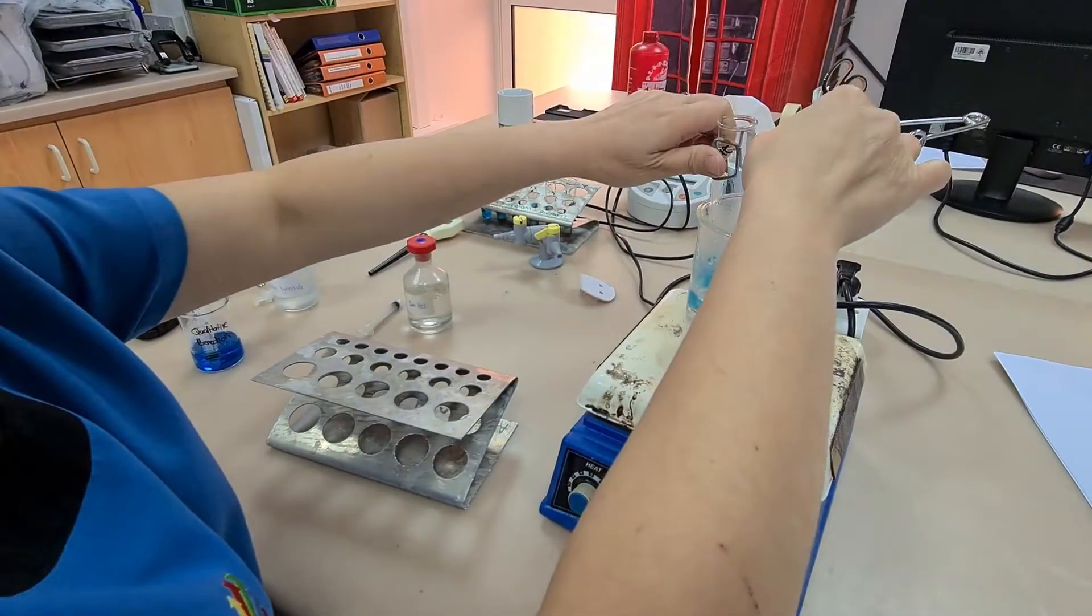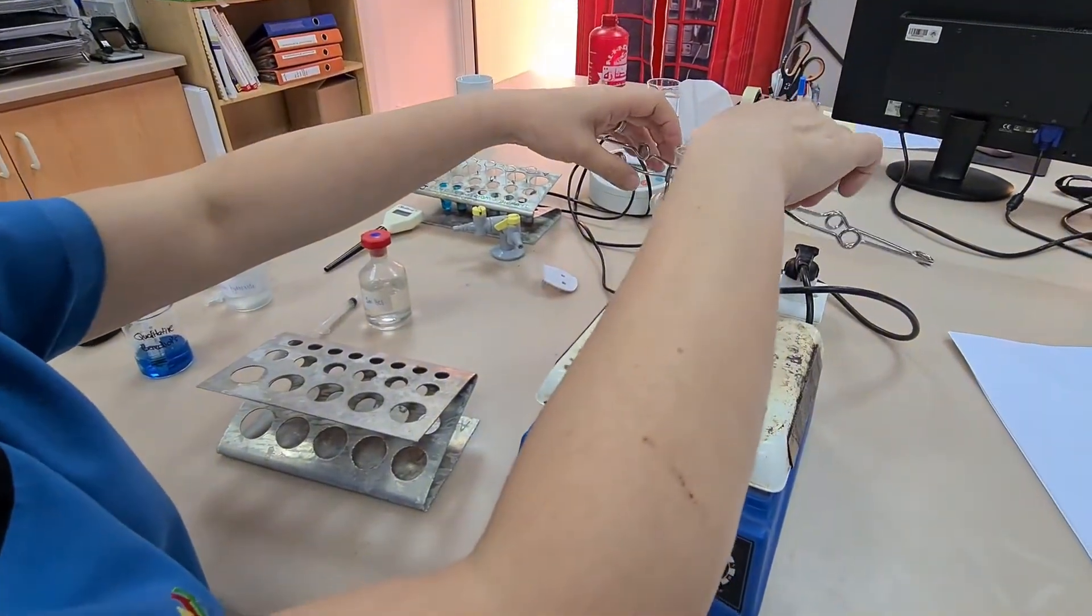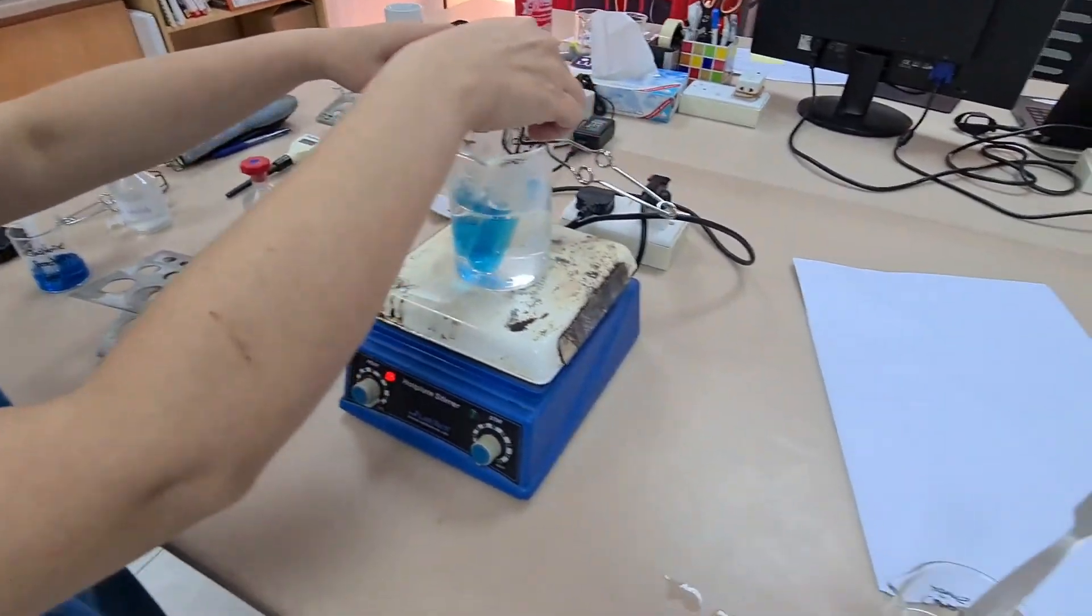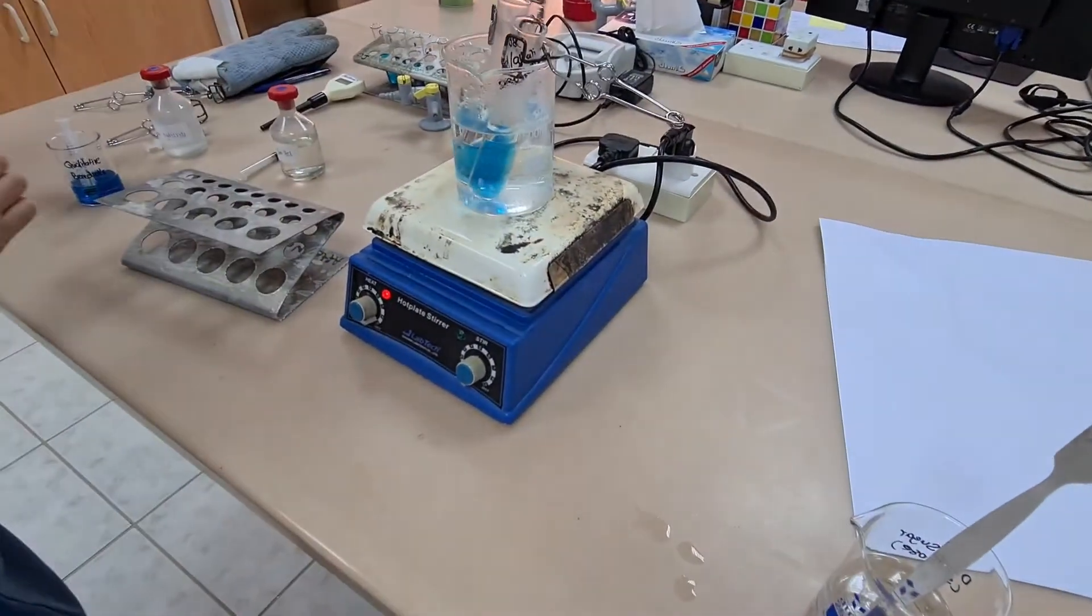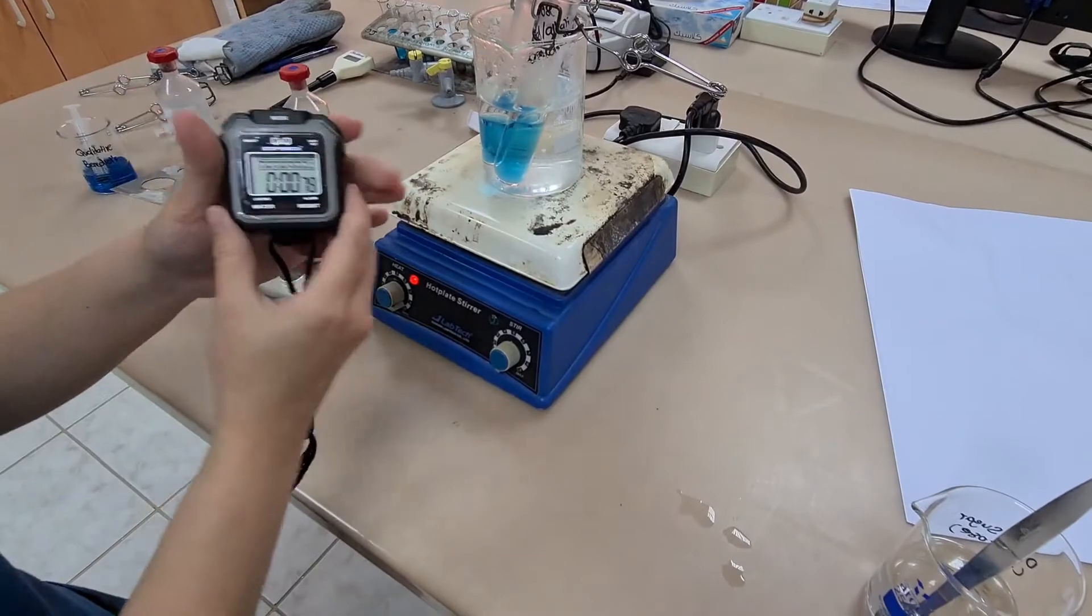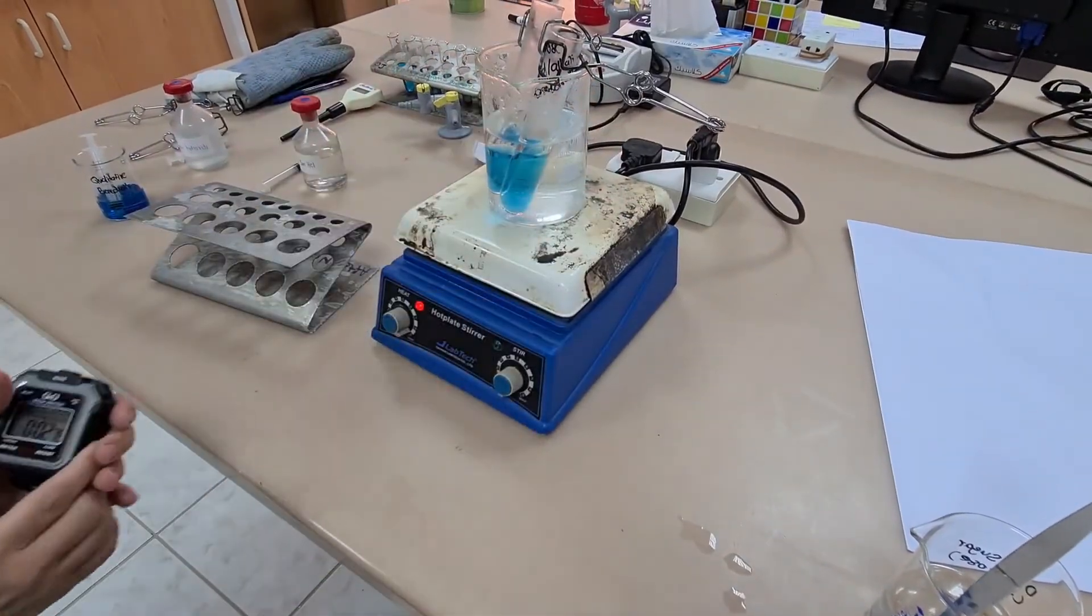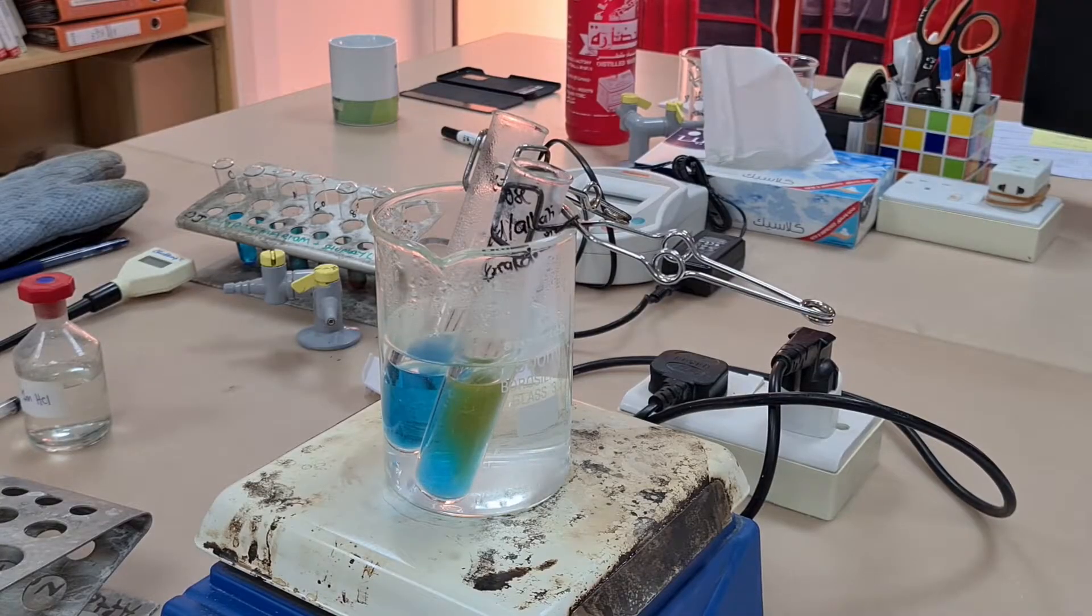So now one of these sucrose solutions has been hydrolyzed with heated acid and the other one remains sucrose solution. They've had the same volume of Benedict's reagent added and we're now going to heat it in a boiling water bath for five minutes.